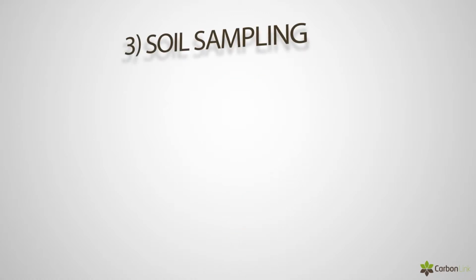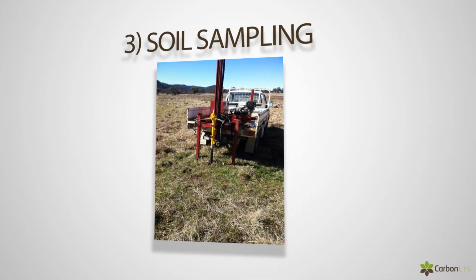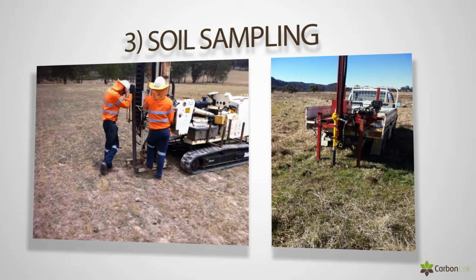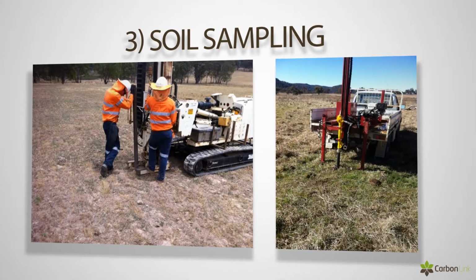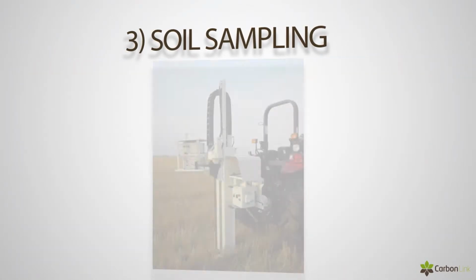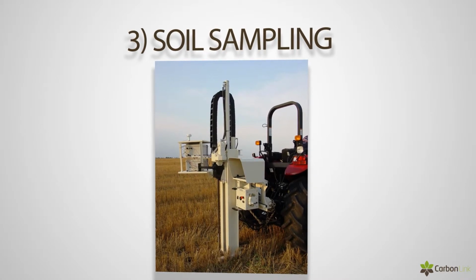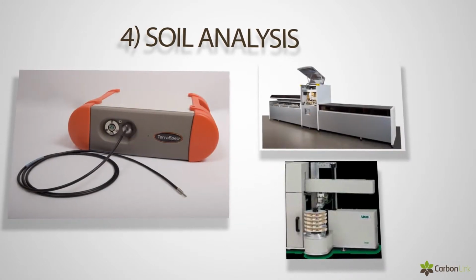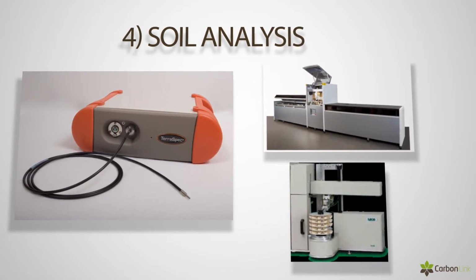It's then able to establish where we need to go to take soil cores, and you'll see the old agricultural paradigm on the right, which couldn't drill soils in this country because it was too hard by the time we got to do it, and so we needed some fairly heavy gear to be able to do that. A different unit here that's used in the United States for measuring soil cores. Once the cores are pulled out, they're no longer analysed in the old way in a laboratory. There are several techniques for measuring not only the carbon but the bulk density in the soil.